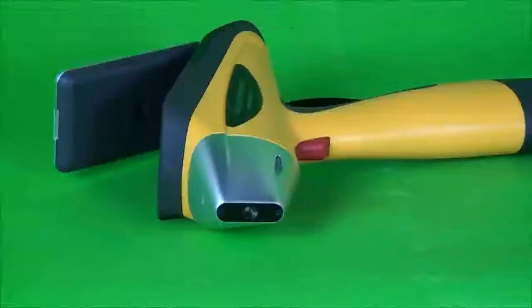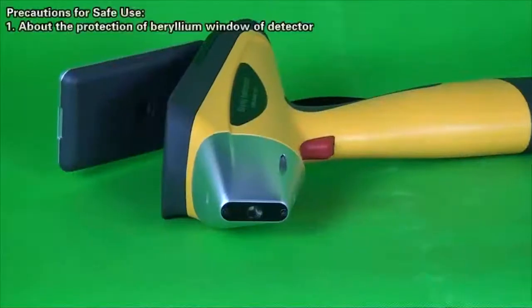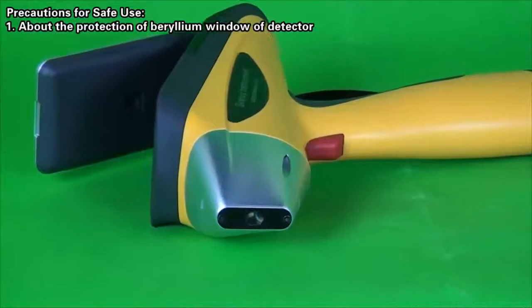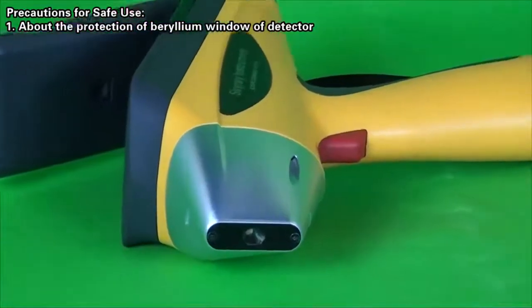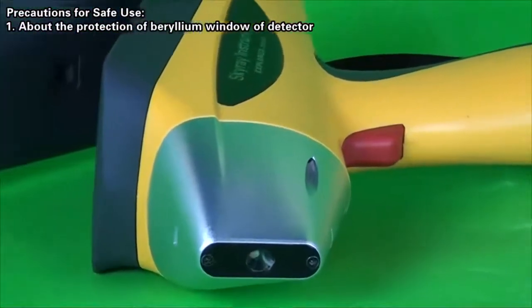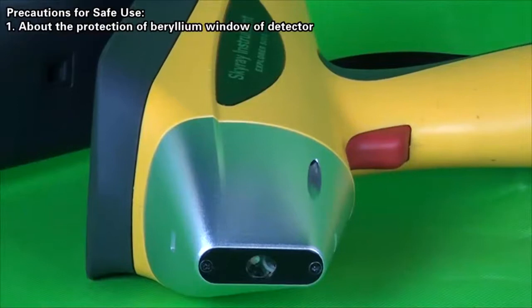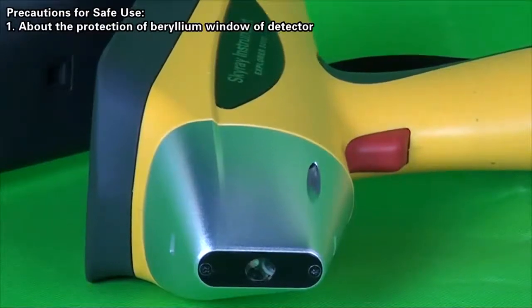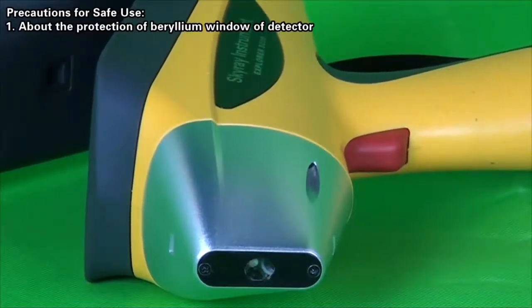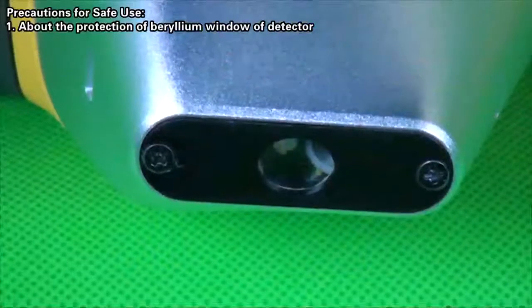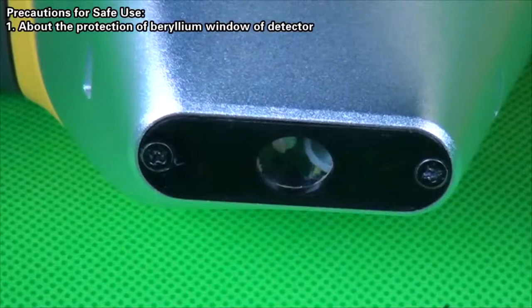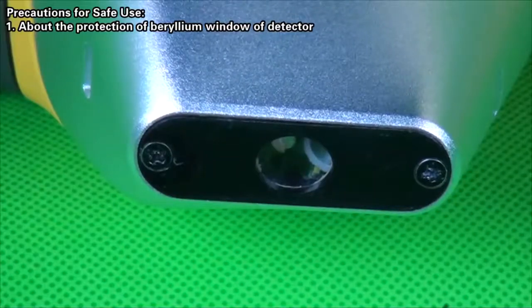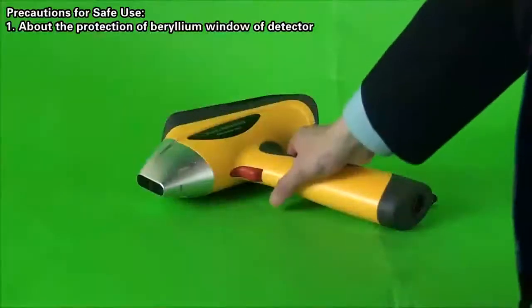Precautions for Safe Use. About the Protection of Beryllium Window of Detector: Once the beryllium window of detector is broken, due to the effect of external force, device may not be normally used as a result. Therefore, care shall be taken to handle the detector lightly when using it.